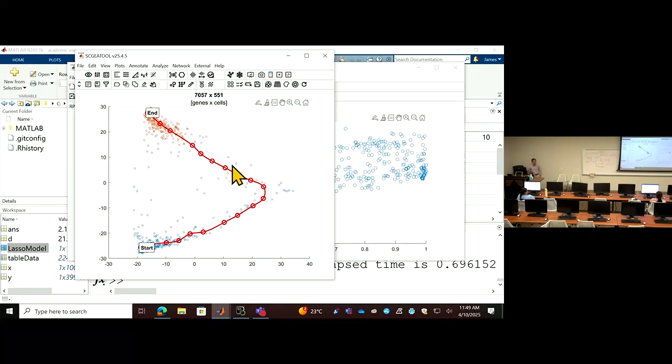Okay, so this is a pseudo-time trajectory analysis. We are using a real data example, but maybe biologically not realistic. There's no link between alpha cells and those developed in week 8; they're just isolated groups, but for demonstration purposes, we just draw a curve between them. That's not true because they are not intermediate steps, but it depends on your applications.